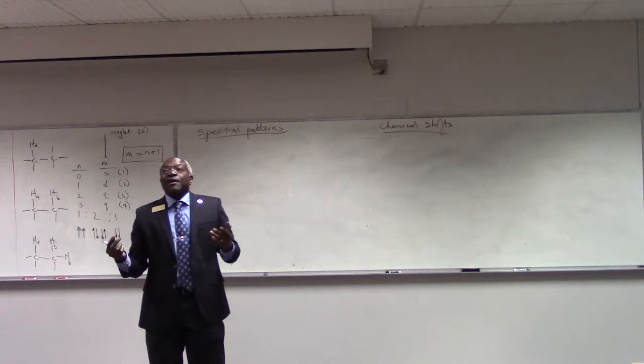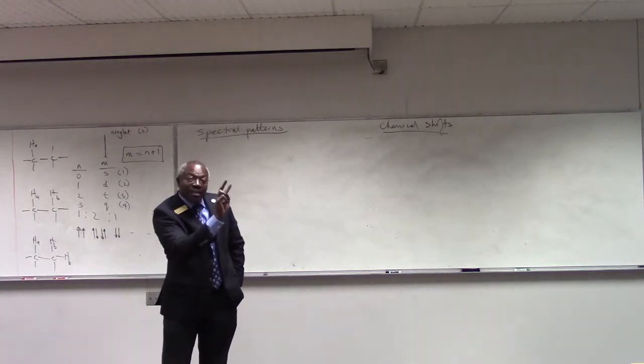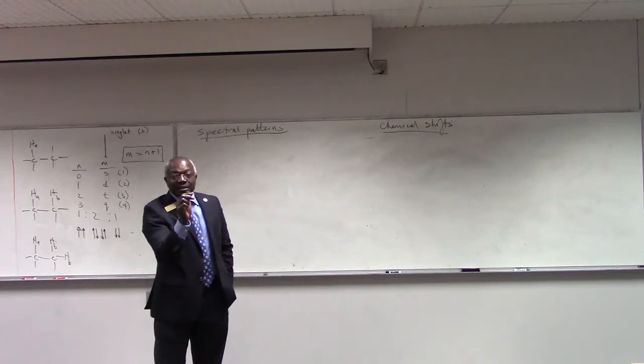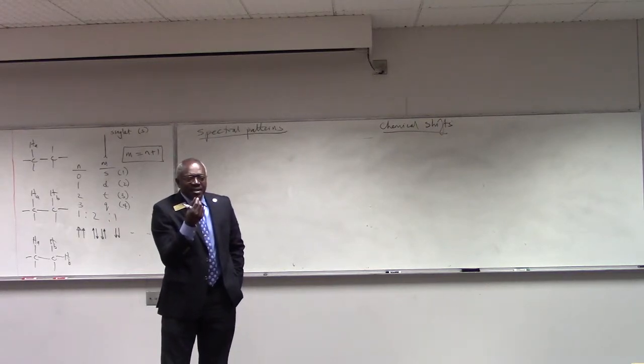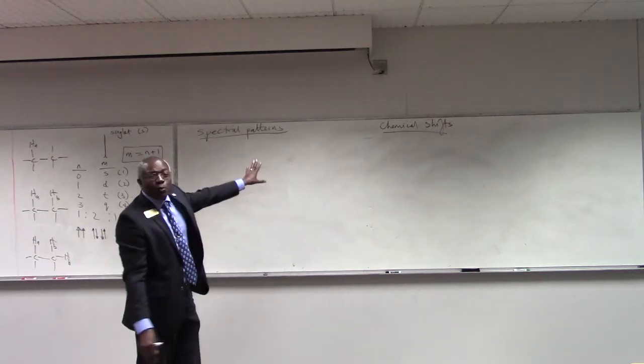Same way when you look at an IR, you might see a carbonyl band at 1710, that says something. If it's got a doublet at 2800, that's an aldehyde. So there are some quick hits to get from a spectrum. That's what we're going to be doing here.